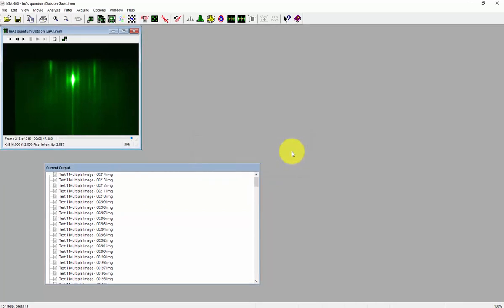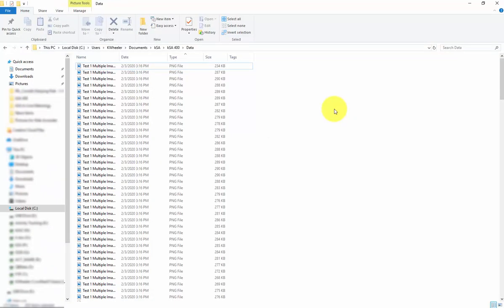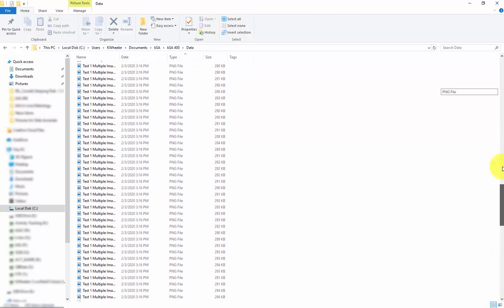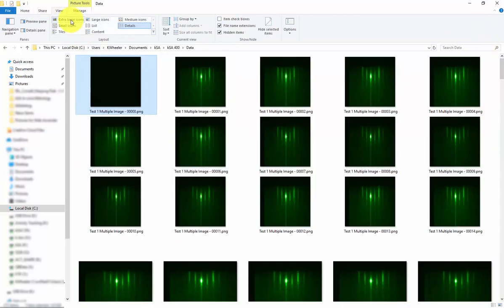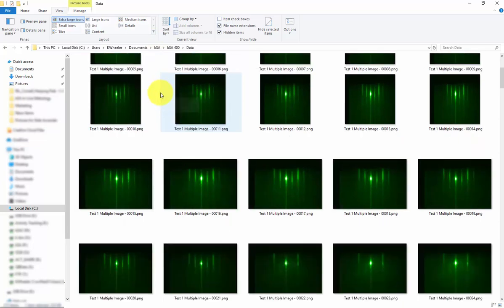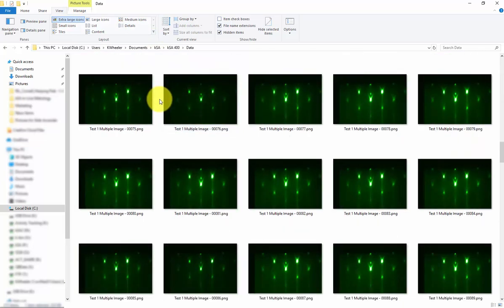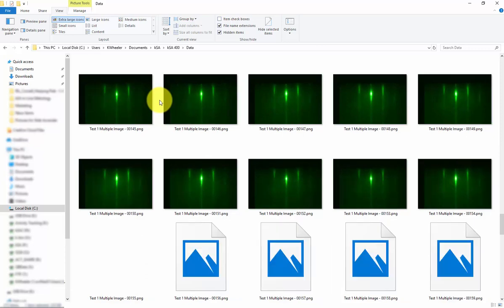A new window showing the results will pop up. You can now access these files in your output folder. You can see that each .img file was turned into the file type selected, which was a .png. You can sort the files how you wish and continue on with your project.